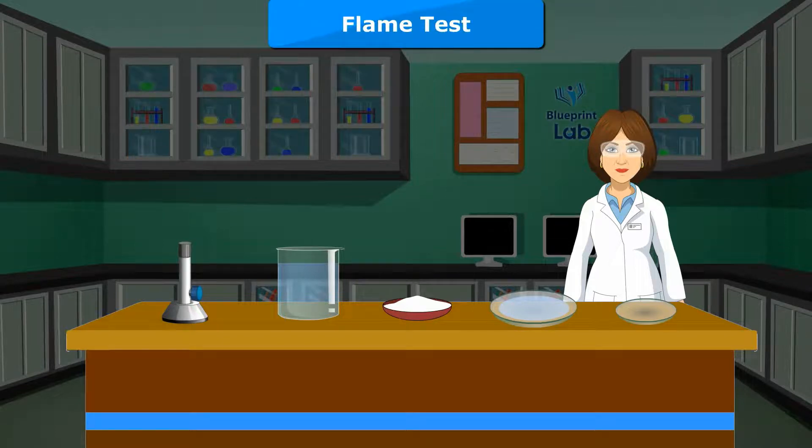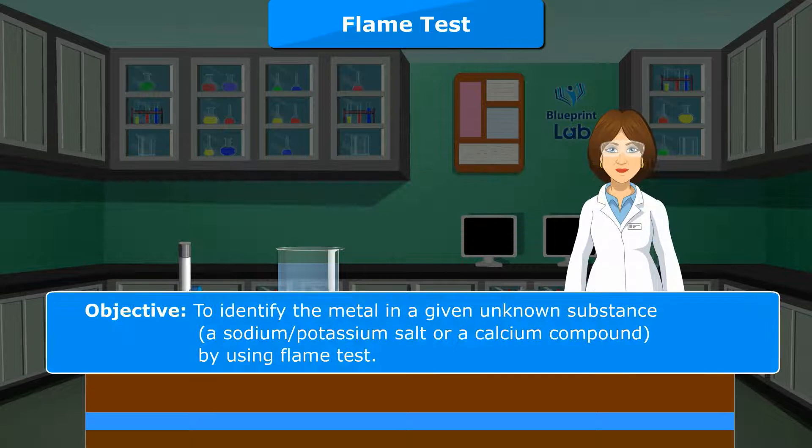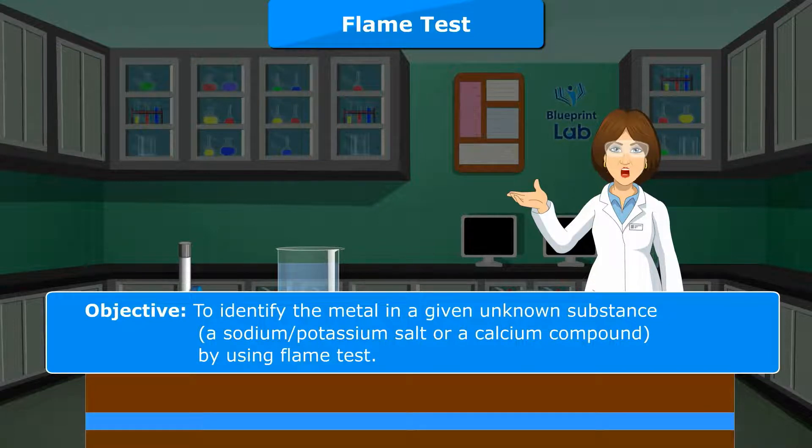Flame test. Experiment 4. Objective: To identify the metal in a given unknown substance — a sodium or potassium salt or a calcium compound — by using the flame test.